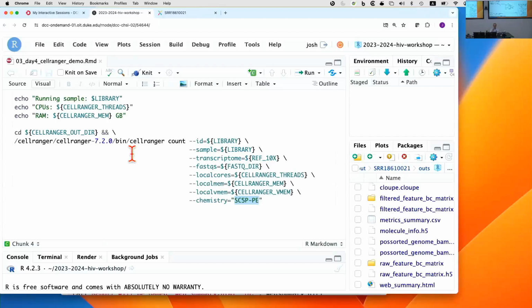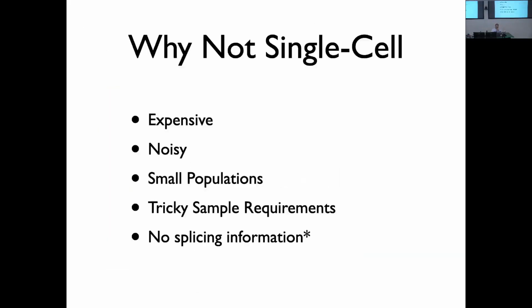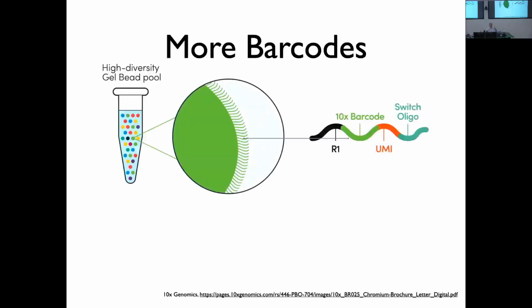The first one is actually really simple when I tell you. I don't think I figured it out myself. I think I had to look it up. Is it bridge amplification? Nope. It's even dumber than that. So the question is, I told you every bead has the same cell barcode on it, right? For this to work, for a given bead, all the oligos on the bead have to have the same cell barcode. So all the oligos have different UMIs. That's easy. Well, I think it's easy, but I can explain.